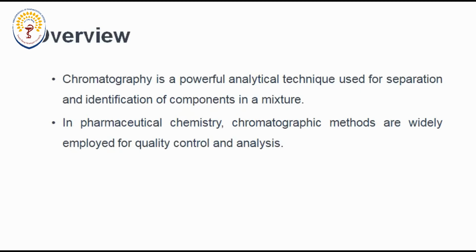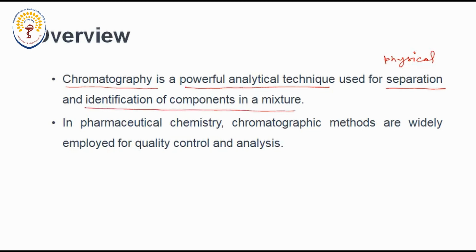So dear students, in this chapter we will learn about chromatography. Chromatography is a very powerful analytical technique. It's a very important technique. It is a method of separation, particularly a physical method of separation. And this method of separation is used to identify the components in a mixture.